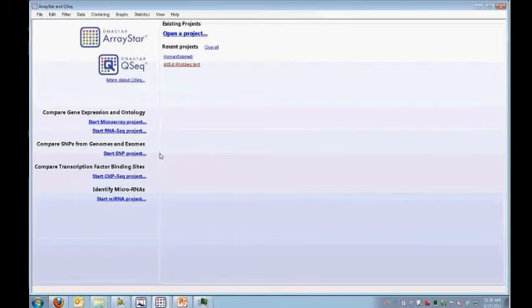So comparing software is always tremendously difficult. It's just a huge task for any one person to try to undertake. So most of the feedback that I get is just from customers that have been using different software. There's two primary differences. One, open source software is usually designed for very specific purposes. For instance, there is specific software that does de novo assembly of short read Illumina data. That same software cannot do long read, and it may not also do Ion Torrent or templated assemblies.